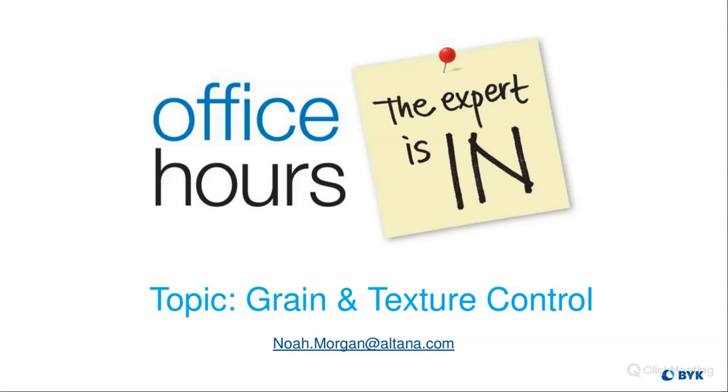Question here: does the software that comes with the device provide advanced filtering, separating, and analysis of the texture data specifically? I know it does the color and gloss, but... Yeah, absolutely. Are you able to pull up any examples? Yeah, give me one second here.